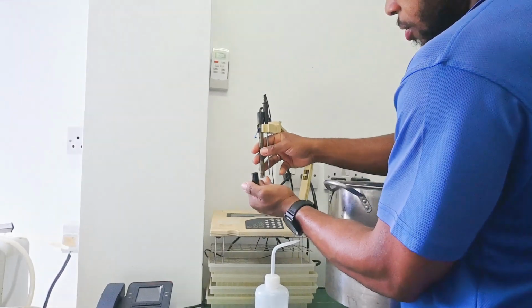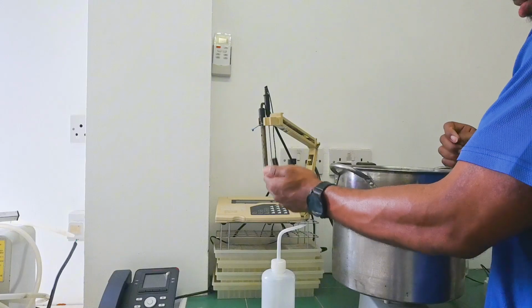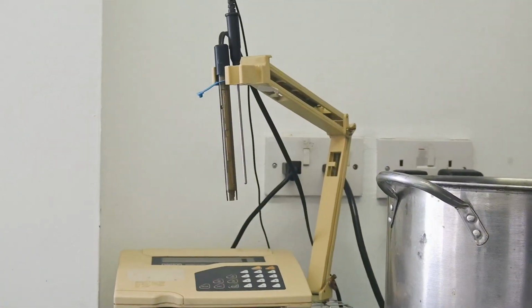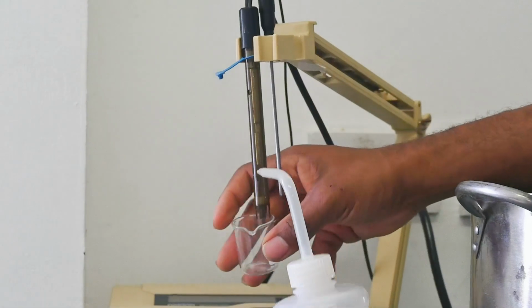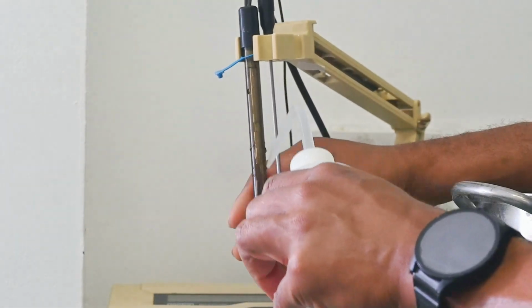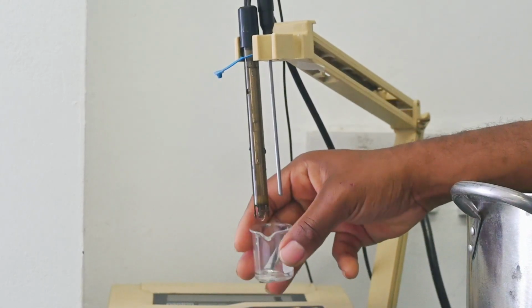It has a glass rod on the end with tiny perforations. That's to allow the reading. So the storage solution is to keep the pores open, but we have to rinse it to remove that filling solution before. So we use this bottle with distilled water to clean it, to remove any of the filling solution that is on it.